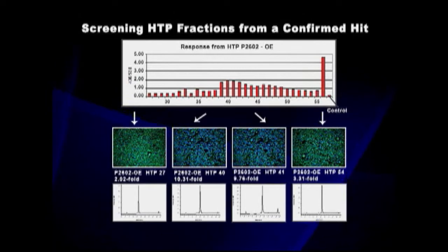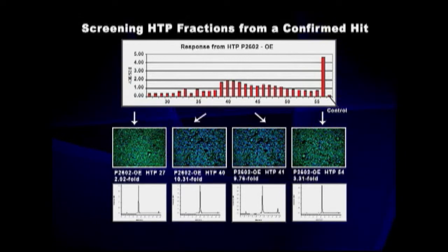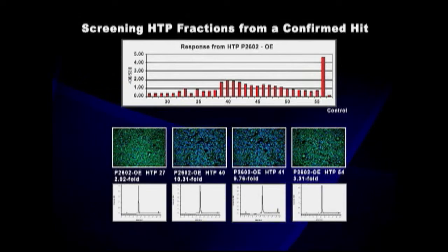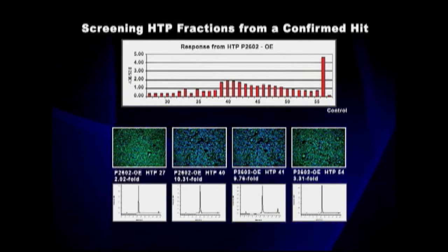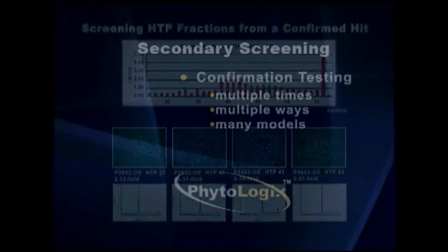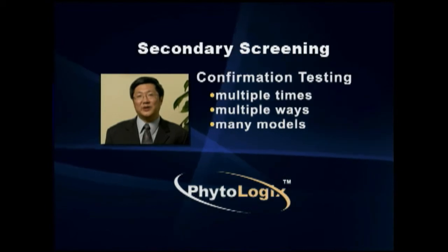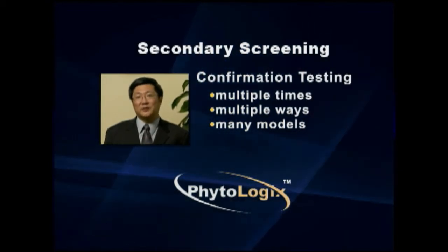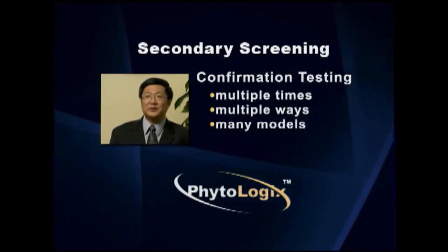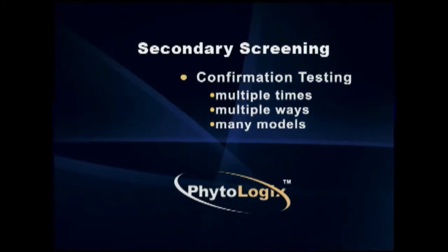After we isolate the purified active components, those compounds are put back into the screening model to retest, to make sure the activity is still there. We also measure the EC50 or IC50 and, based on the dose response curve, confirm those compounds are active components. After testing on the primary screening model, we develop secondary models on different cell lines or different systems to confirm the functions of the active components in secondary or tertiary assay systems.